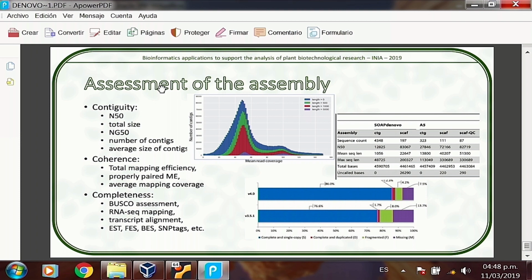If you take a look at your files, you'll see that your assembly should be around the 130,000 mark. That's pretty good. You're expecting to get a genome of 150, and you got an assembly of 130. That means that you've assembled nearly 90% of your genome. Yet there's a part that is always going to be missing. Those are the gaps, the unknown regions.